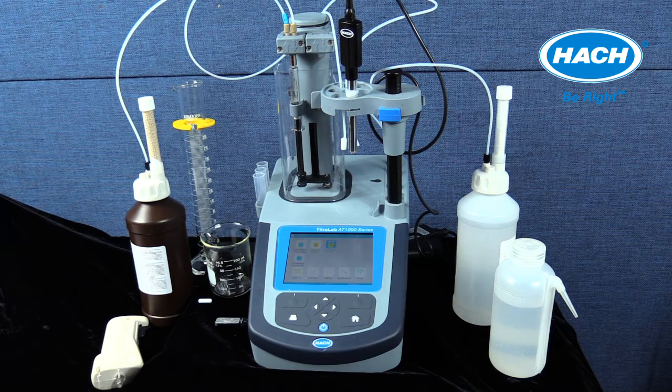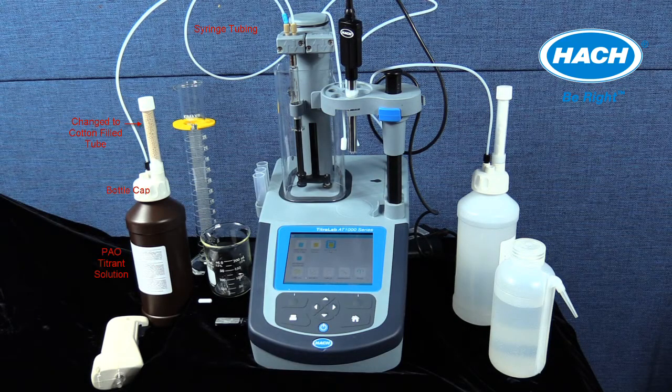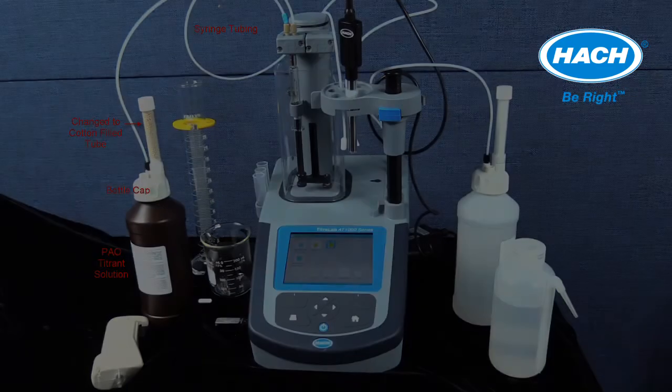The titrant side of this titrator has been prepared. This includes the following. The phenyl arsine oxide or PAO titrant solution was purchased, the bottle caps installed, correct syringe tubing, note the dispensing tip and downward arrow, fed through the bottle cap, and the desiccant cotton-filled tube installed in the bottle cap. The pump side of the titrator has also been prepared.